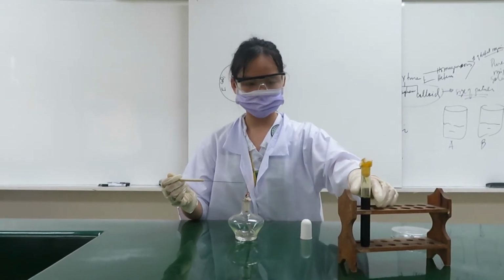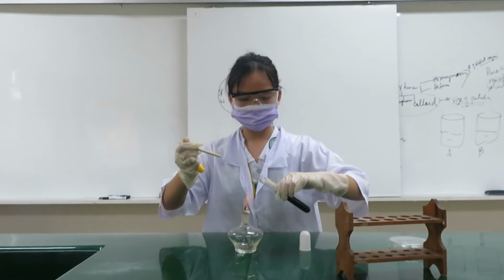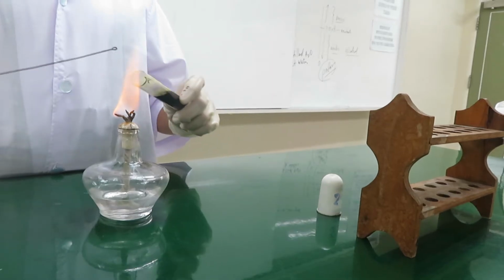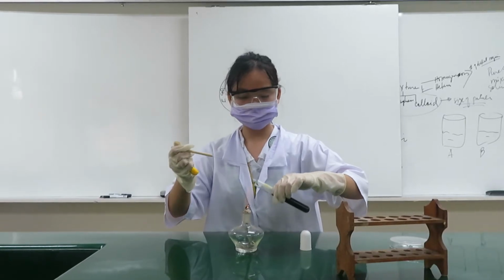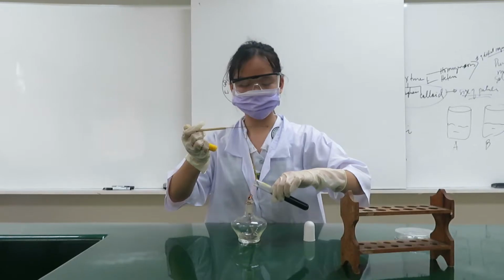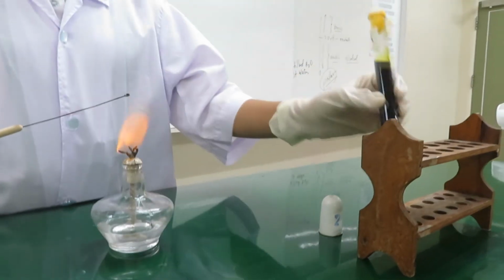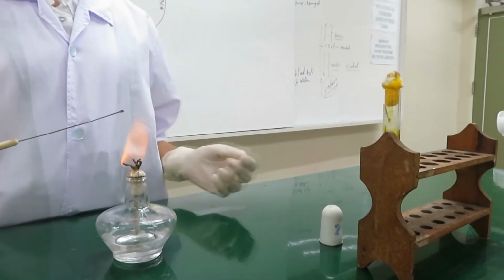3. Obtain the inoculum for the plate. If the inoculum is a cell suspension, get a loop full with a metal loop. The rim of the tube should also be flamed before and after removing the inoculum, just like the loop. If the inoculum is a colony, use a cooled loop to touch the colony and be able to get a few cells from it.